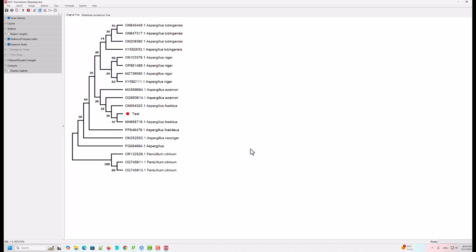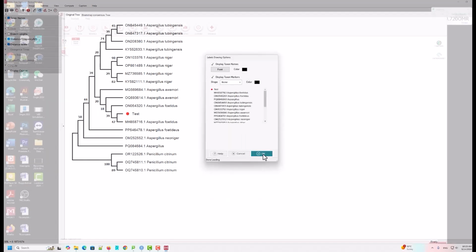And then at the end you will give a title, the phylogenetic position of that pathogen, or the phylogenetic position of that species. So in that section you will place this tree, and then you will know why this tree is important, why this tree is here, and what I want to show here. So in this tree, it will show that our species of interest is this test. Okay, so now we discuss this tree, the branches and label. I hope it will be easy, and you can do it by yourself.